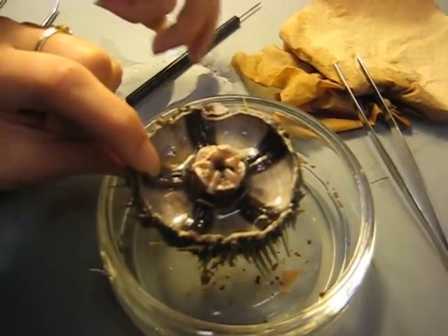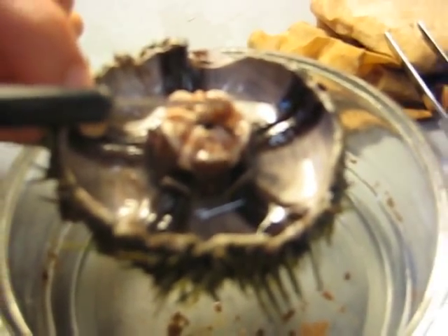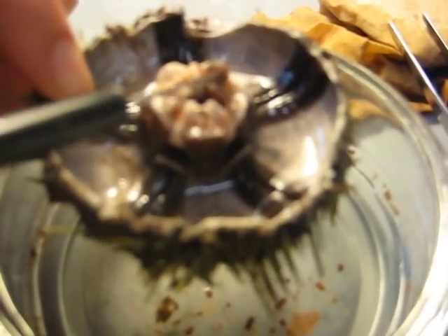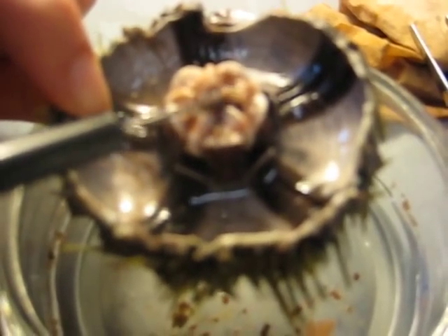This is Aristotle's lantern. This part that comes off the top here is the mesophagus. The stone canal also should come off here too, but we think that that is gone.